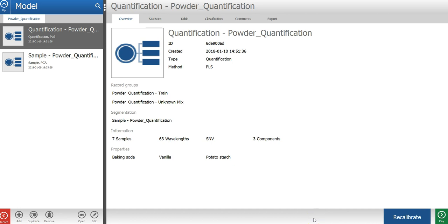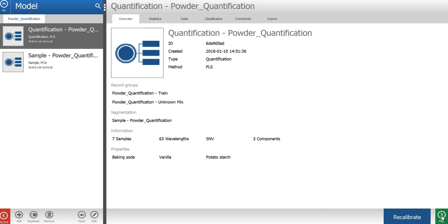Now let's create a prediction workflow using the quantification model to analyze the percentage of the three powders in images with samples of unknown content. To do that, I will press the play button in the lower right corner to move from the model mode to the play mode.